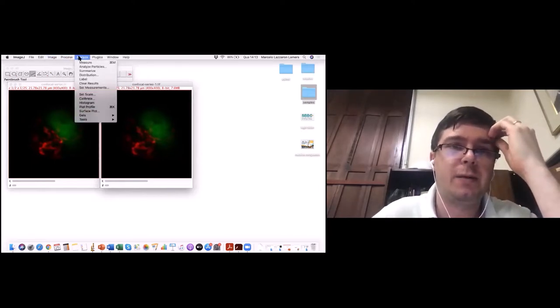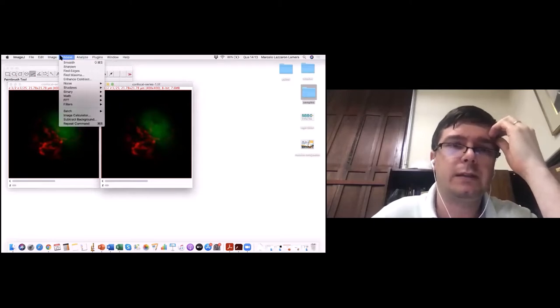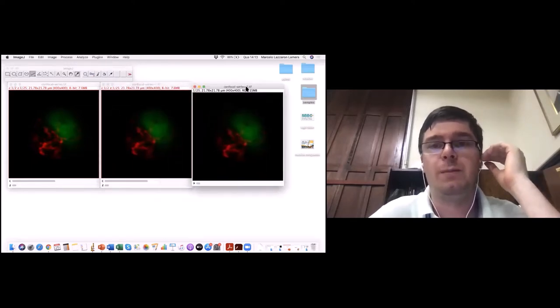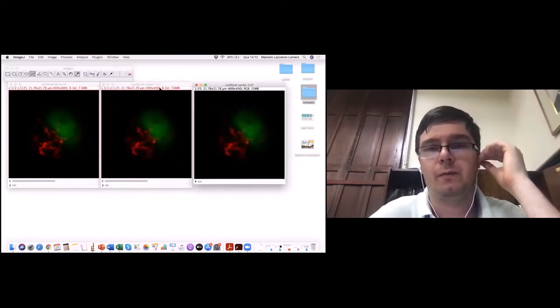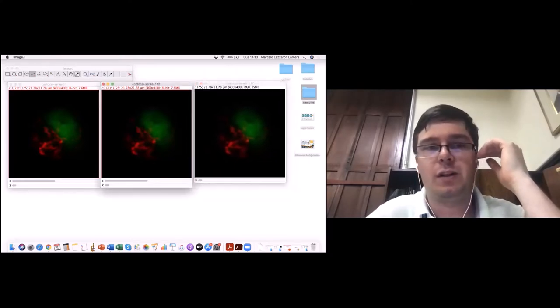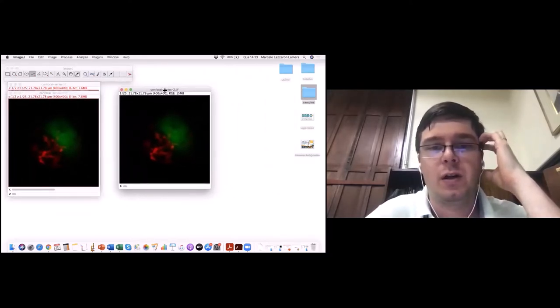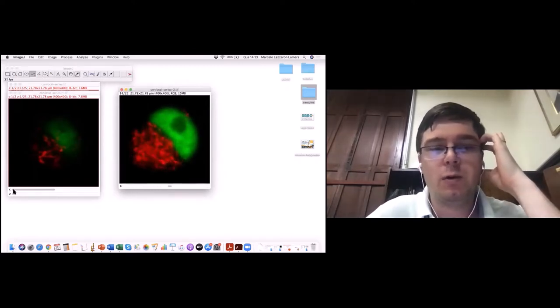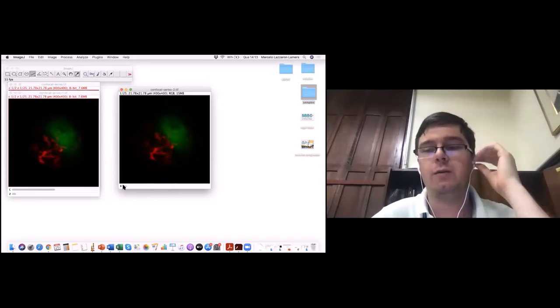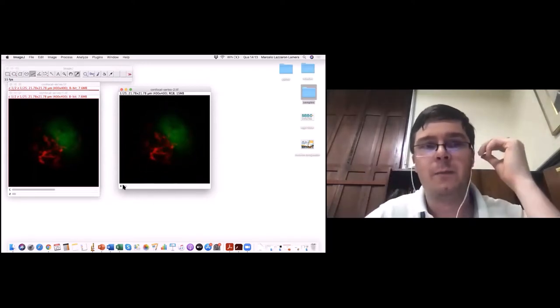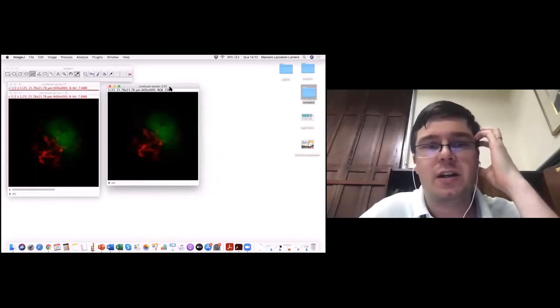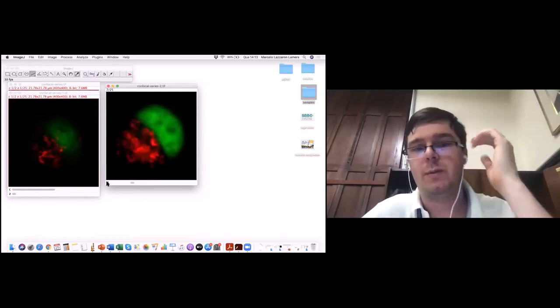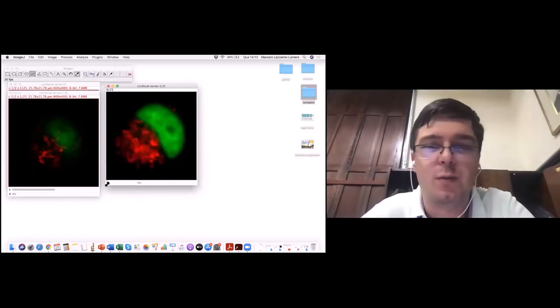Vamos mudar para RGB: Image > Type > RGB Color, mudando tudo. Olha a diferença: tirei o channel, virou tudo um canal só — não tenho mais dois canais. A imagem está em RGB. Fazendo o eixo Z, vai de cima para baixo. Olha que espetáculo, acho muito bonita essa imagem. Só que olhando assim, o nosso olho engana um pouco.